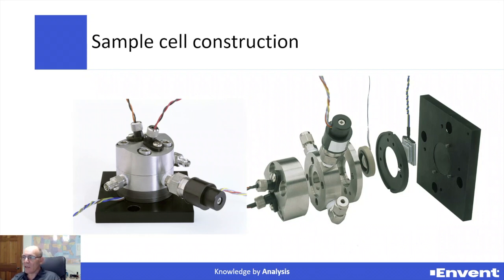And the Peltier is this. This is the mirror surface, where you can just make out the concave, acid etched mirror, and the PRT is embedded in the mirror, and this is the 3-stage Peltier that controls the temperature of the mirror. So this square black block underneath the Peltier is the heat sink for the Peltier. If we're cooling this mirror, we've got to dump the heat from the Peltier out into this block, and this block sits on the inside face of an analyzer to act as a big heat sink, and this gives us quite a sizable depression.